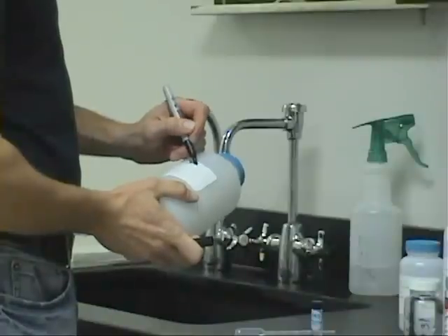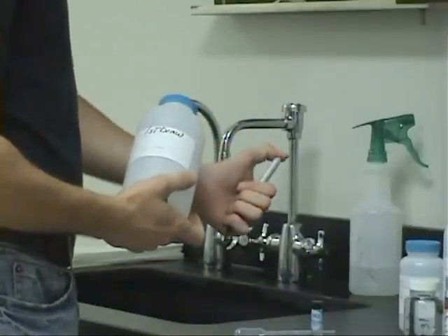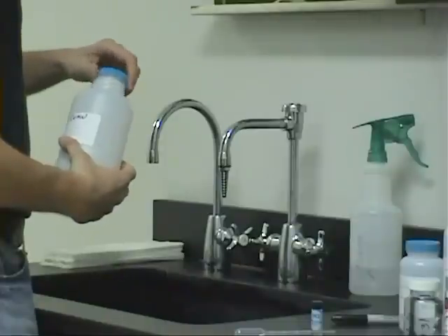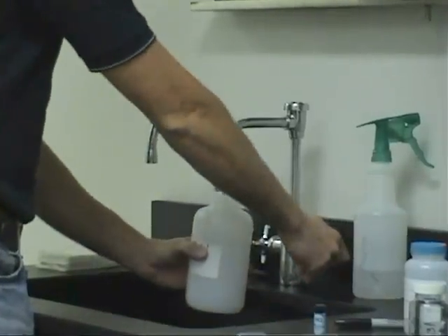When sampling for first draw lead, collect the very first drops of water by holding the bottle under the tap prior to turning on the cold water. Do not use cold water for at least 6 hours before sampling.